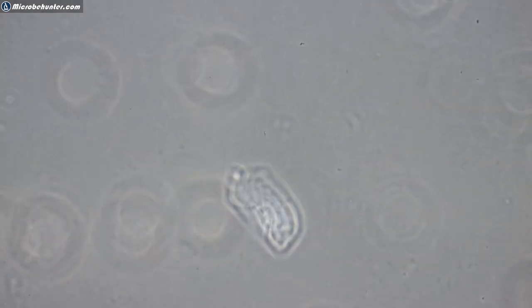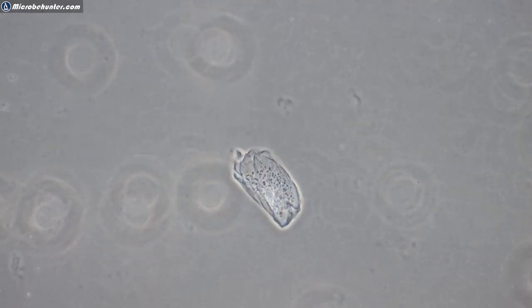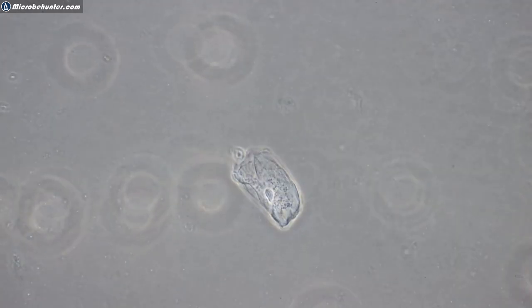I mean, I have taken samples from my cheek. It was actually very dense. So maybe those Q-tips are a little bit too soft, okay? Yeah, so that is phase contrast.